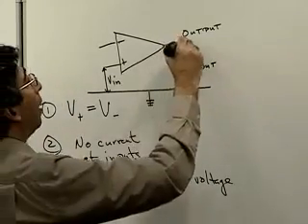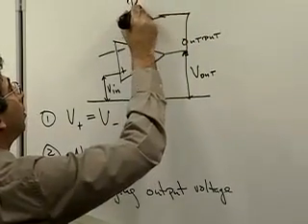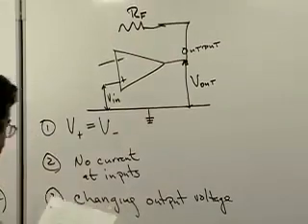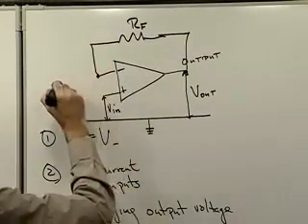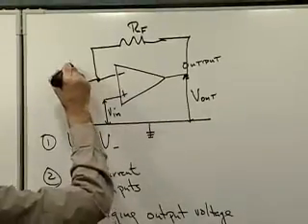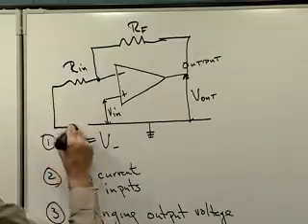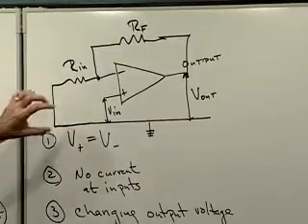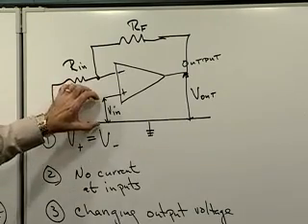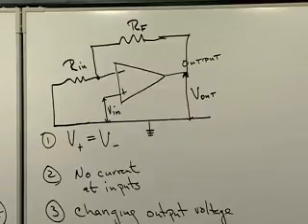And then we can add in a resistor here, some resistance that we can hook in over here, and a second resistor over here, which would be an input resistance, and we can ground that whole thing so we have a complete circuit. Okay, so the thing that we are going to control is that V in, and we let the op amp then control V out.